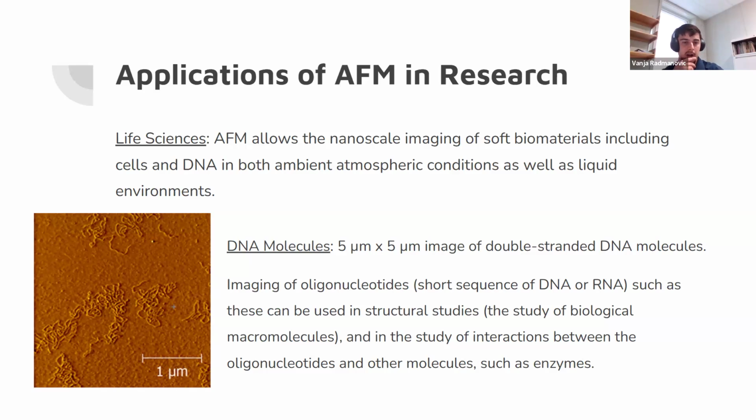The first example, like the image to the left, is DNA molecules. This is a 5 micrometer by 5 micrometer image of double-stranded DNA molecules. And imaging these short sequences of DNA, such as these, can be useful in the study of biological macromolecules or in the study of interacting these DNA strands with other molecules like enzymes.